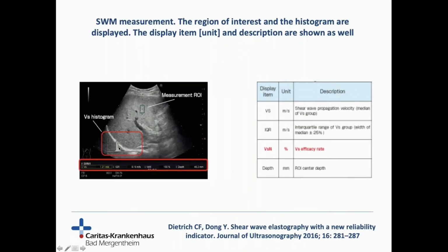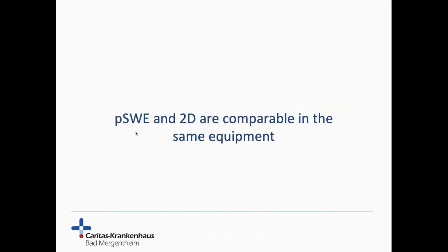As mentioned, we have to think about quality parameters in each technology used. And here, shown in a Hitachi equipment, they have their interquartile range measurements, and you have to follow the manufacturer's instructions for their quality measurements, which is often above 90%.